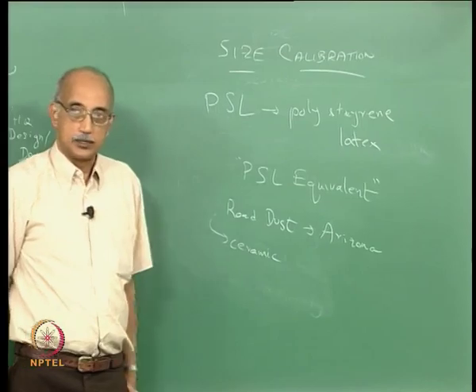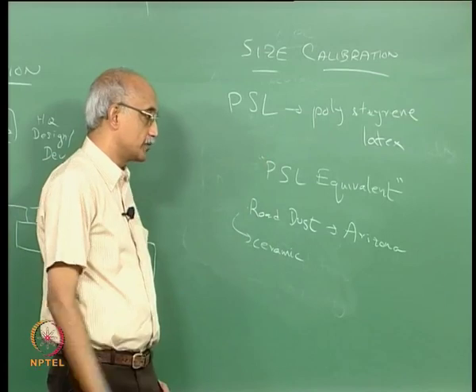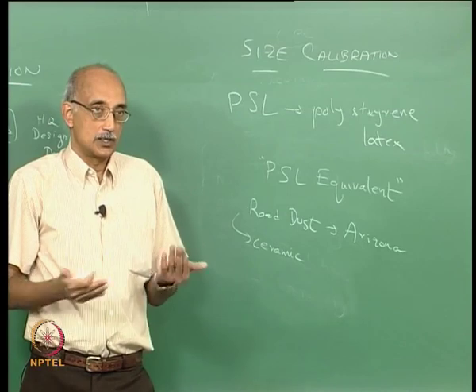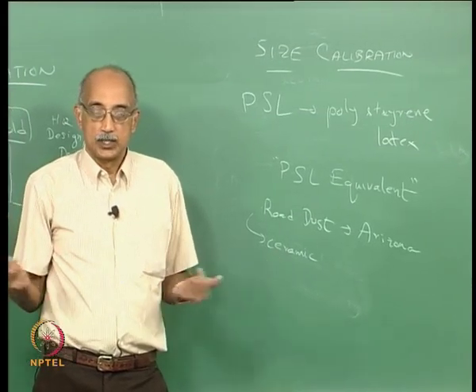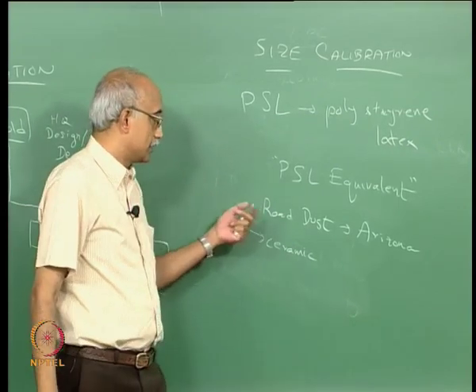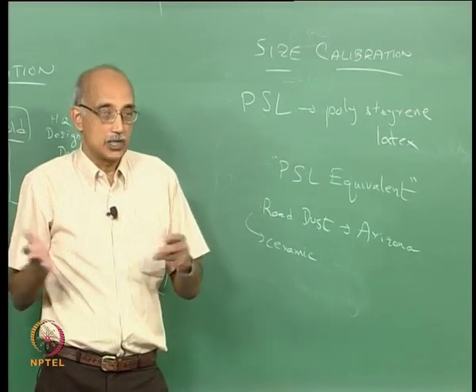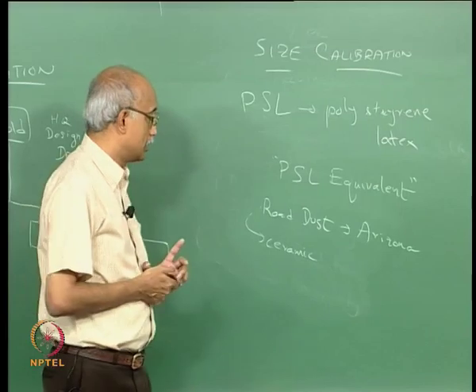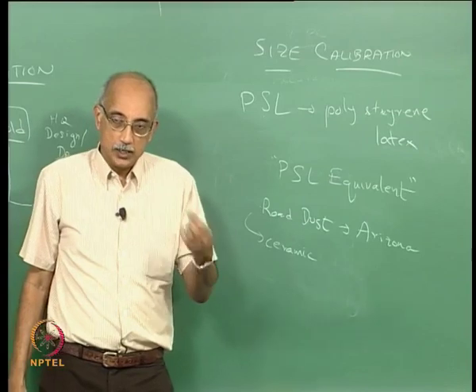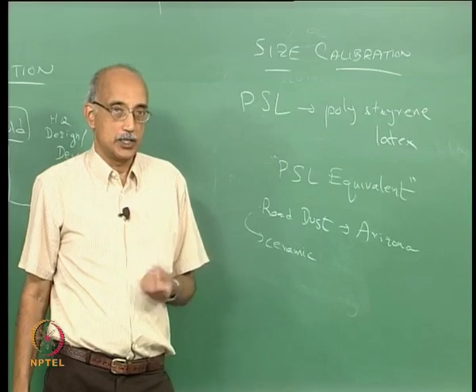as your calibration standard. The difficulty though is that it does not satisfy many of the properties of PSL. You cannot, for example, get it in a monodispersed form. Dust by nature is polydispersed, right? So, you really cannot do channel by channel calibration using the road dust as your calibration standard. So, there are some sacrifices you have to make, but overall the use of a calibration particle that is closer in its optical properties to your actual sample does seem preferable in many cases.